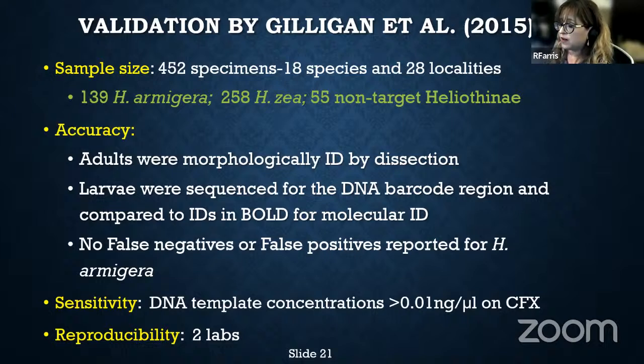All the adults and larvae that were used in this study were sequenced for what we call the barcode region. Not to get too much into it, but the barcode region is CO1, which stands for cytochrome oxidase 1 region of mitochondrial DNA. It's a standard that's used worldwide. It's worldwide accepted that that's a certain region that is PCR amplified, that has been used across many species throughout the world.